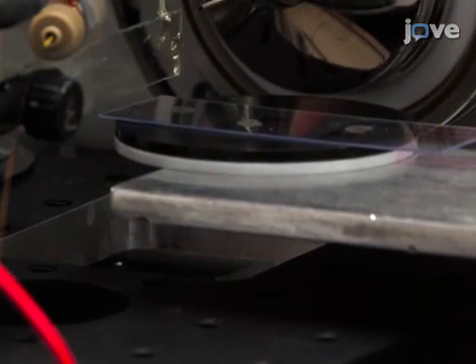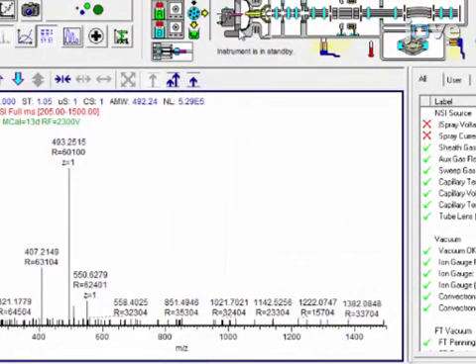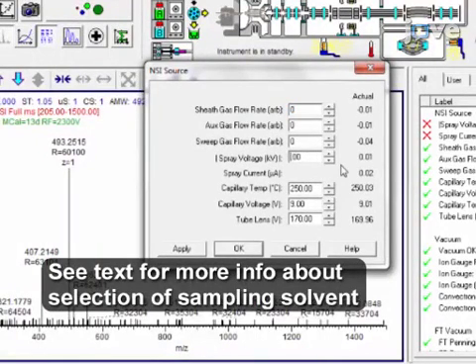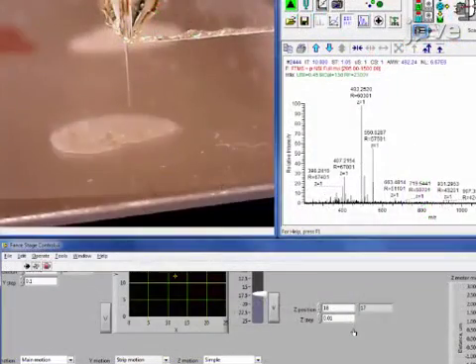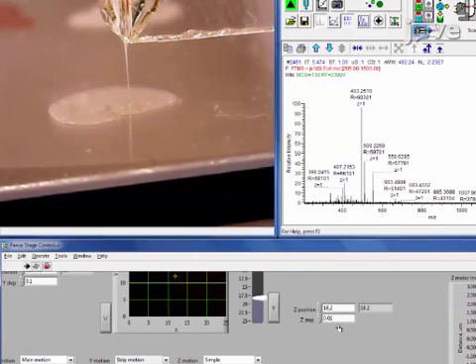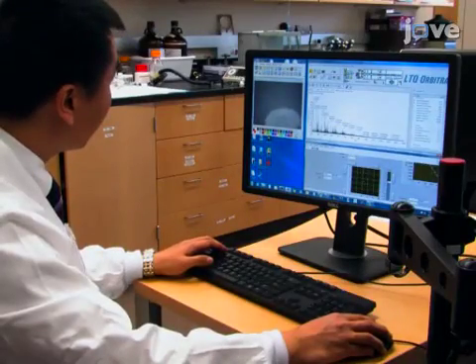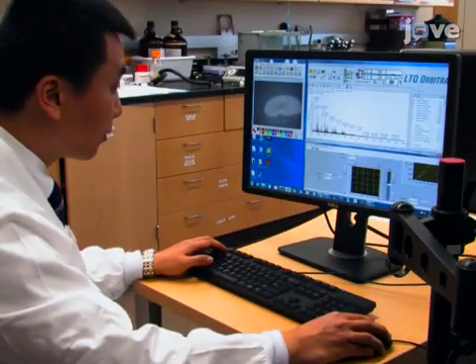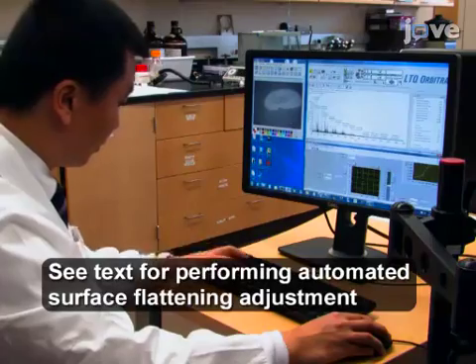Adjust the sample position by changing the coordinates in the control software. Use the syringe to pump the sampling solvent at an appropriate rate and then apply the ionization voltage. Adjust the height of the single probe so that it is resting just above the surface of the sample and able to perform surface extraction of metabolites. Carefully lift the Z stage and use the USB digital microscope to monitor the distance change between the single probe tip and tissue surface.